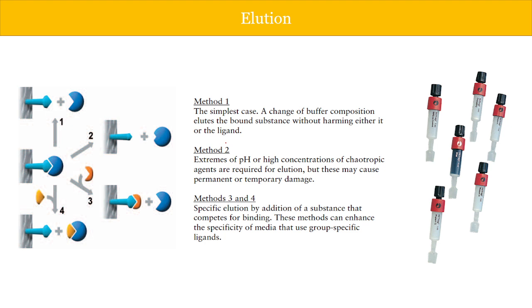But when you are very much interested in your protein and you need to get that protein, some proteins behave differently. So depending on their behavior, sometimes it is necessary to change the pH and increase the concentration of these chaotropic agents. This is another important thing.